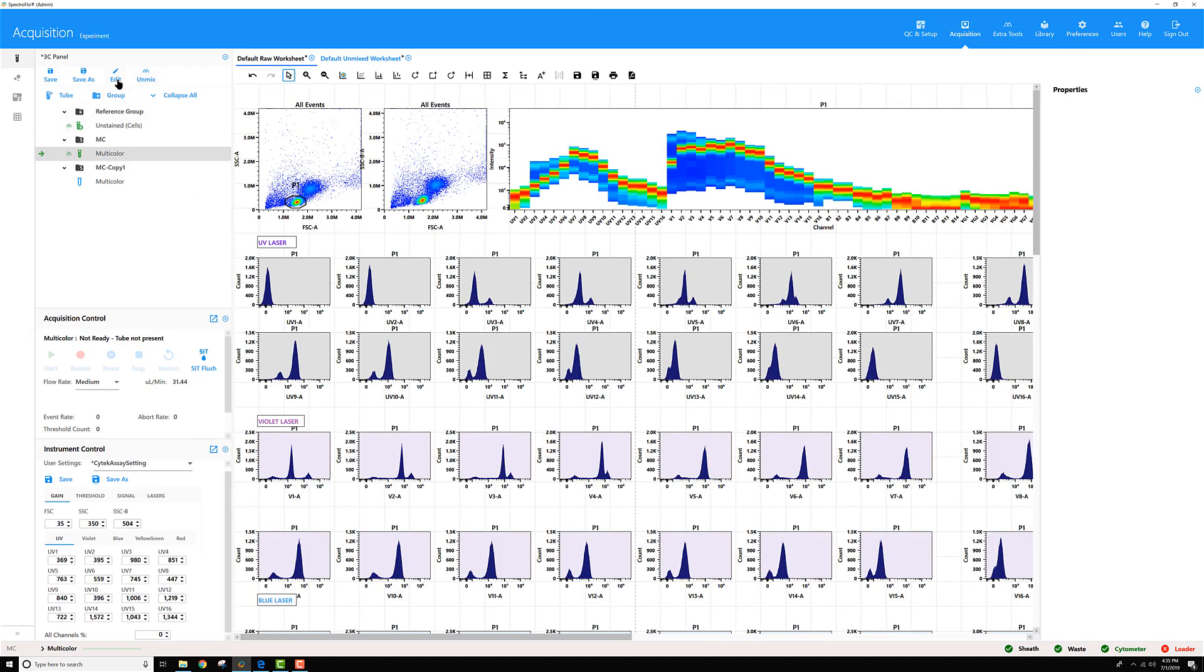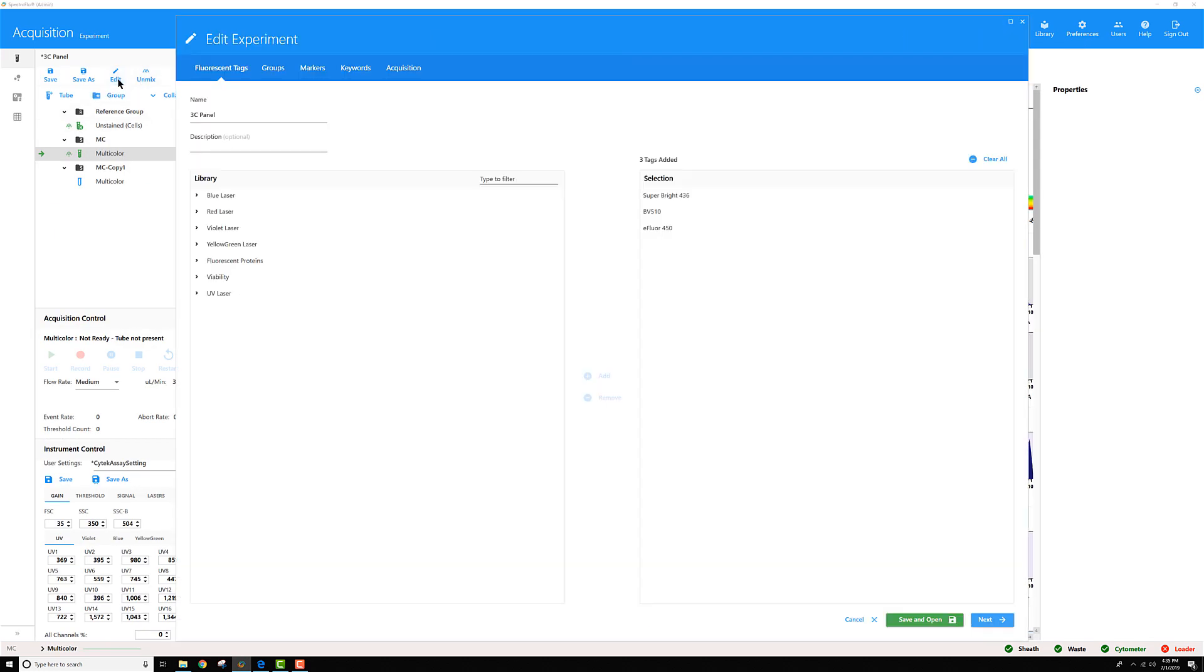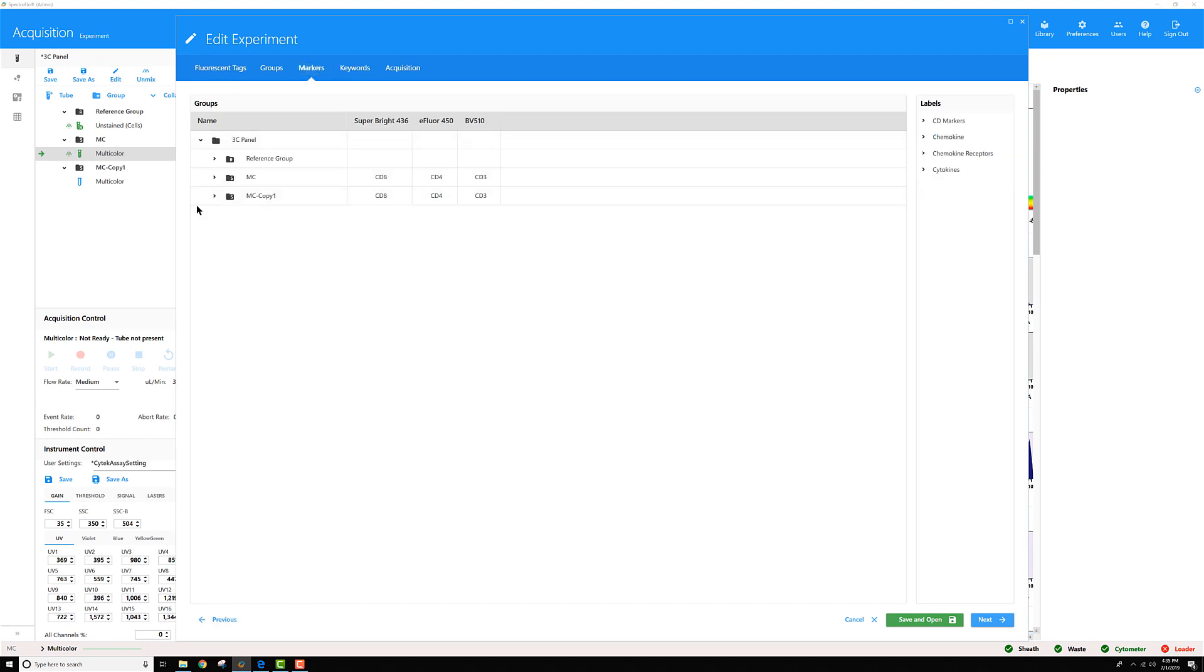Then you'll note in your experiment when you edit it, back under markers, it no longer asks you to specify the lot, it only asks for the label.